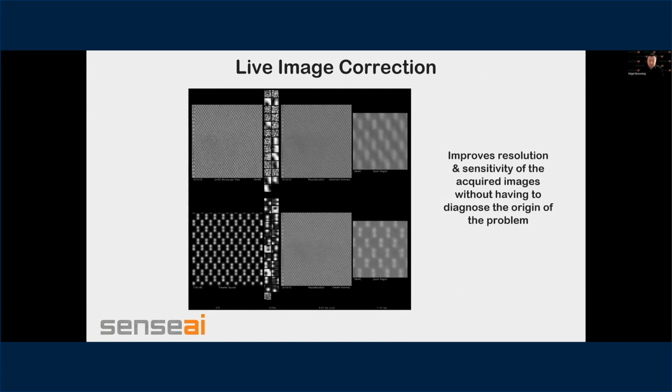At the bottom, what we've done is take a simulation of the silicon dumbbells that you would expect under the imaging conditions of the microscope. And in this case, we're not subject to the signal to noise, we get a high quality image. And if you now do the reconstruction of your image, you actually get back to getting your silicon dumbbells. So effectively, by using the dictionary while we're working on the microscope, and I'll show in a minute what we can do after we finish on the microscope, you can correct for minor errors in the alignment or the acquisition of your images in the microscope.